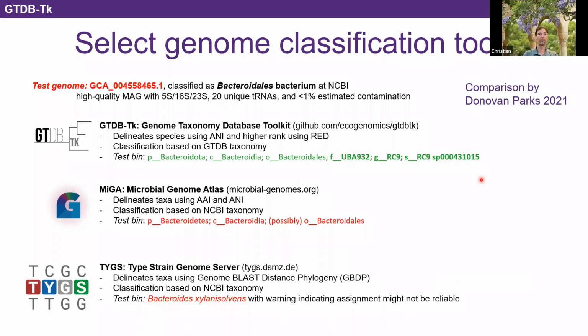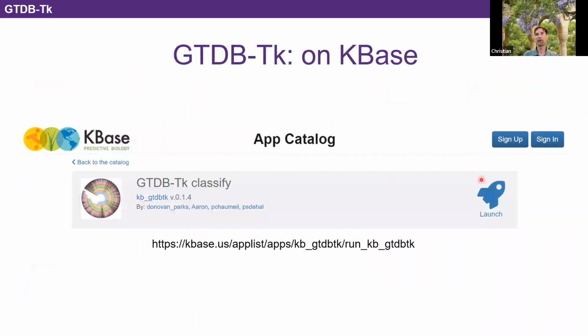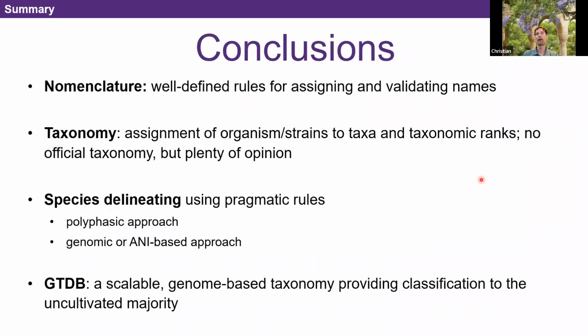If you're not into running GTDB-Tk, it runs on the command line. It has been incorporated in other environments. One of them is Kbase, and that has a GUI, so you don't need any command line knowledge to actually run that. Okay, with that, let's come to our conclusion.